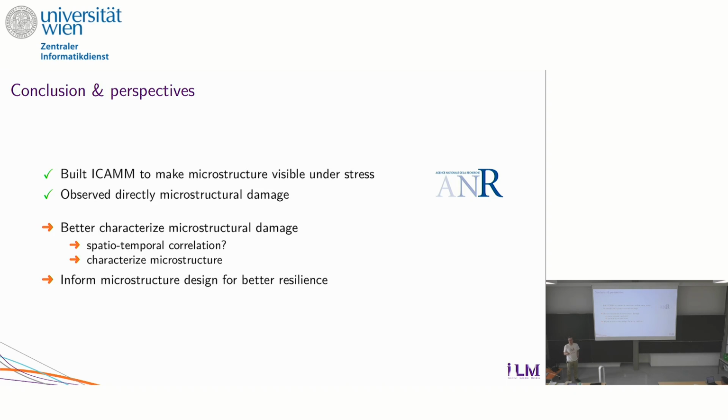Because there are a lot of things to do with that, and that's more or less what I want to convince you about. Some of the questions I have on the top of my head would be: is there a spatial temporal correlation between those damage events? Can we characterize the microstructure where the events occurred and compare it with other places in the gel, and understand why the damage occurred there, which might be nice to actually, if you want, design gels for better resilience?